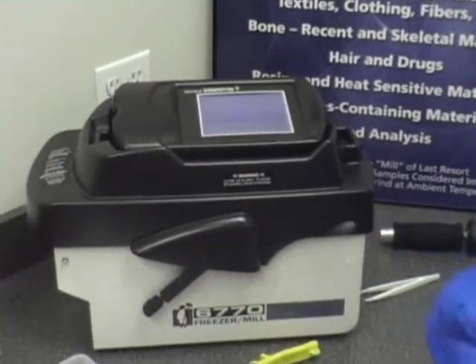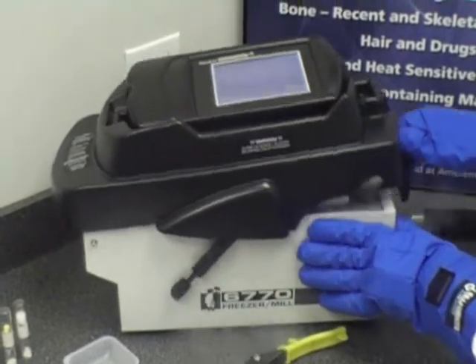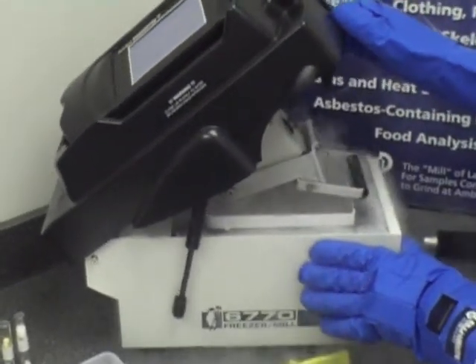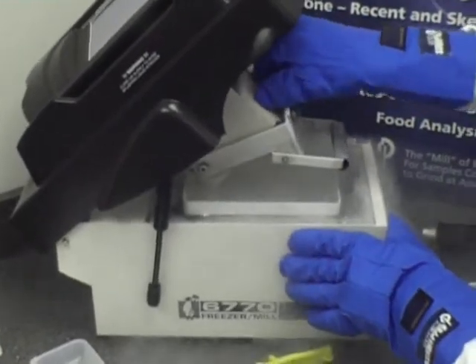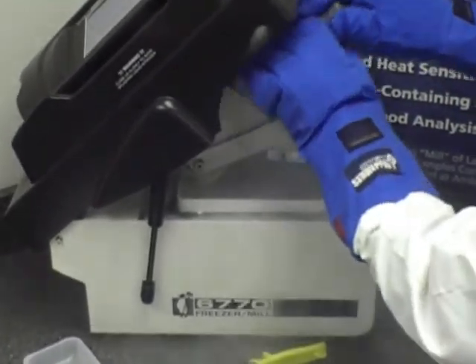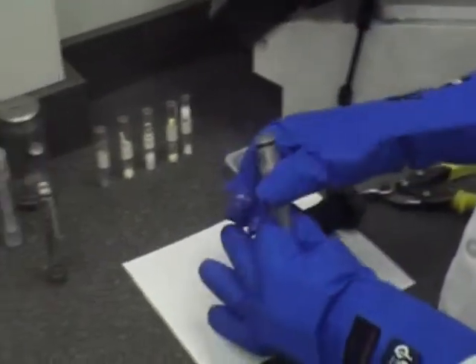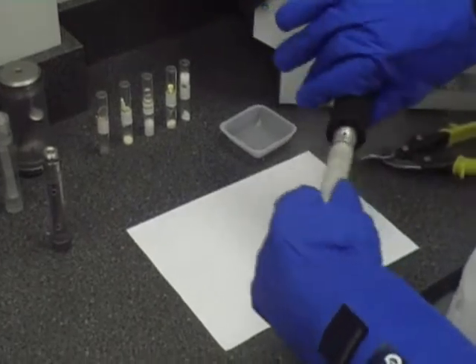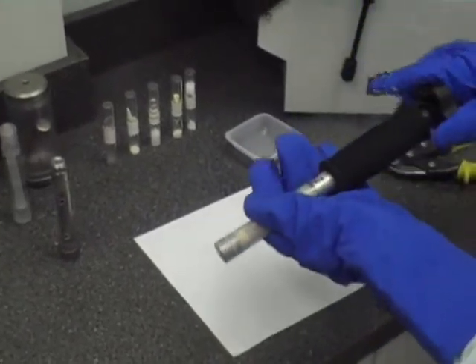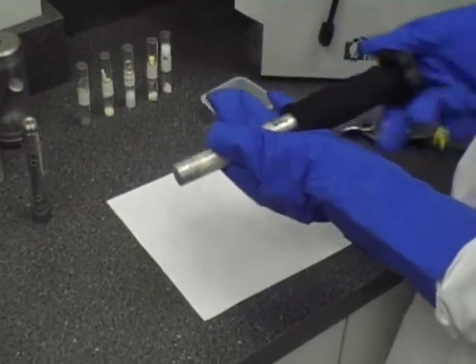We're going to now take the vial out and remove the sample to see just how fine the sample is. Using cryogenic gloves, of course, and an extractor — the extractor acting like a corkscrew makes it very easy to remove the end plug.